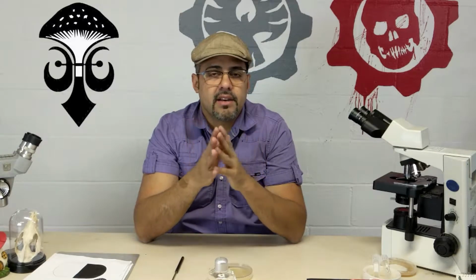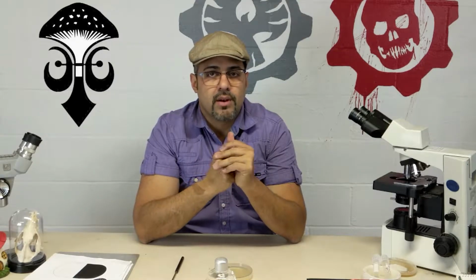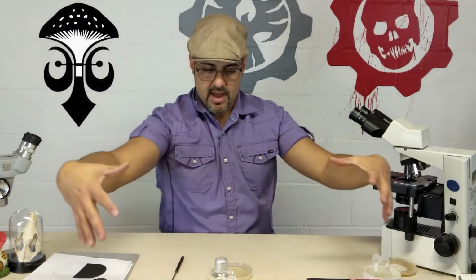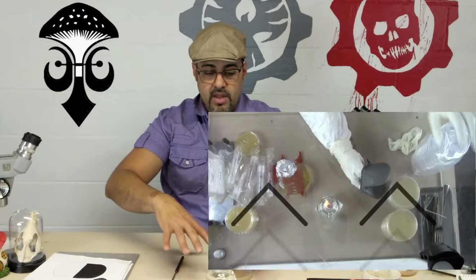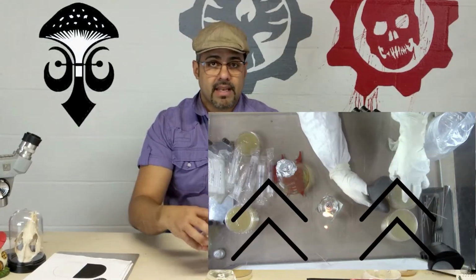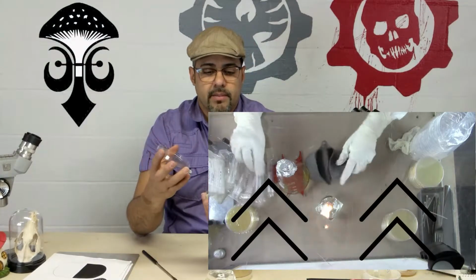So you can see in here the HEPA filter, and the flow goes from the back to the front. So if you imagine we have this environment from there to here, all the clean air is coming from there to here, so nothing is happening in here. I can actually open a plate like that and won't get any contamination.